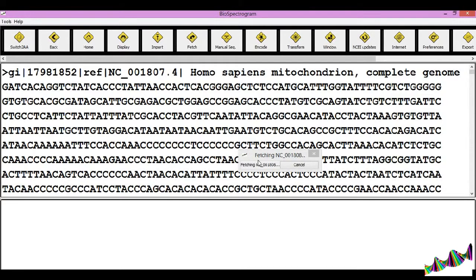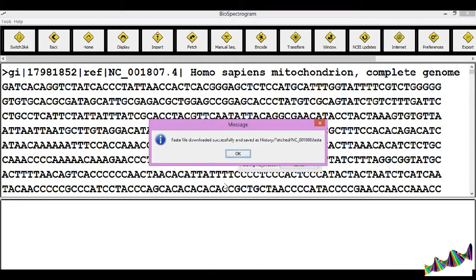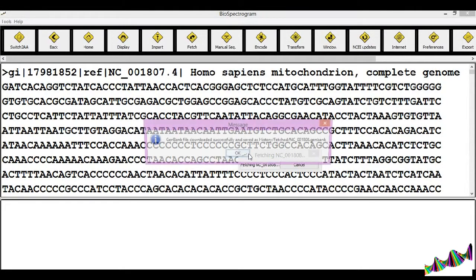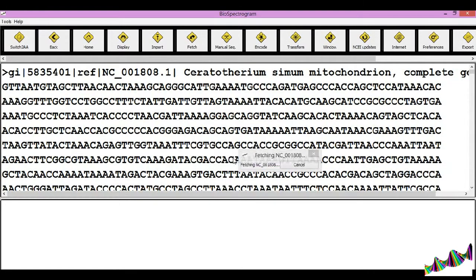Once the file is fetched, it is saved in the history under the fetch subfolder. Both GenBank and FASTA files are saved.